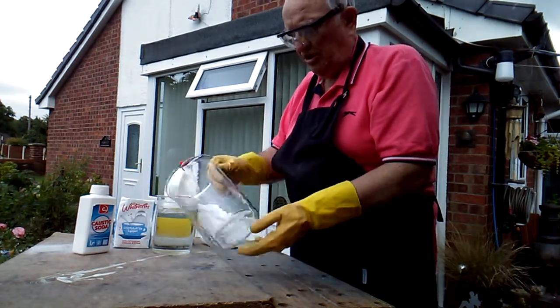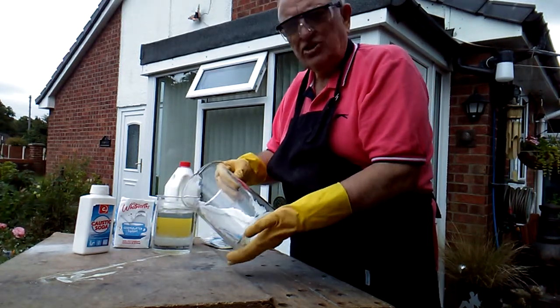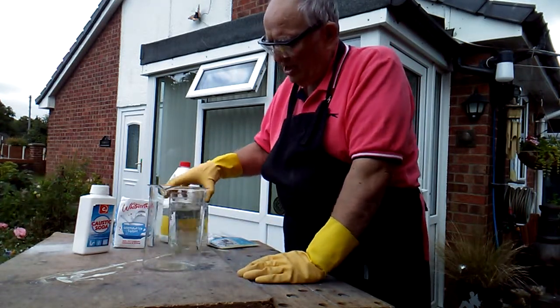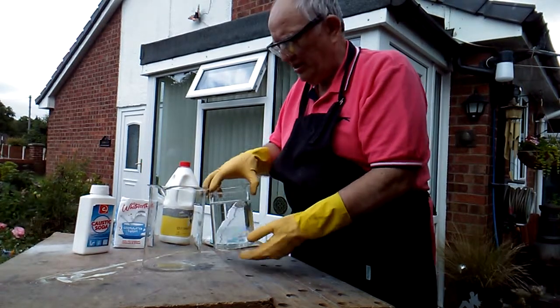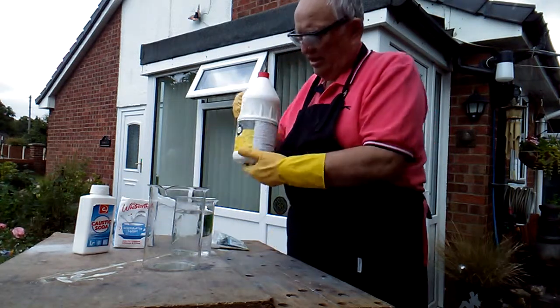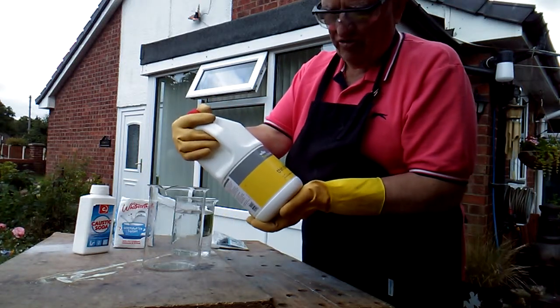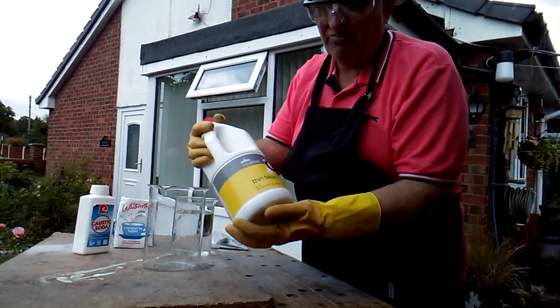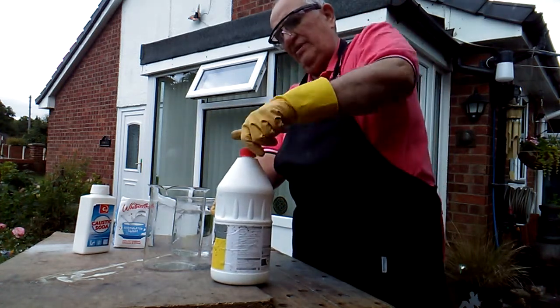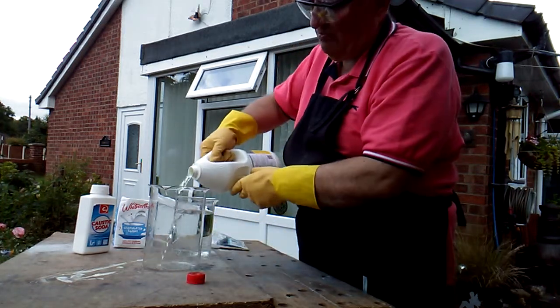Now what I've got here is a large empty Pyrex beaker — they'll take heat. The first part of this isn't going to produce any heat, and this other jug has just got clean water in it. Now what you do is use household bleach. This is just ordinary common-or-garden household bleach — I bought it at Wilco's, didn't cost very much. It's a thin variety; you can get thick bleaches and thin bleaches. I'm going to pour a quantity of this bleach into the big beaker.